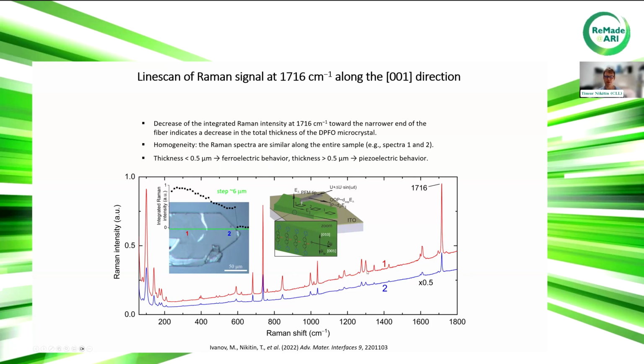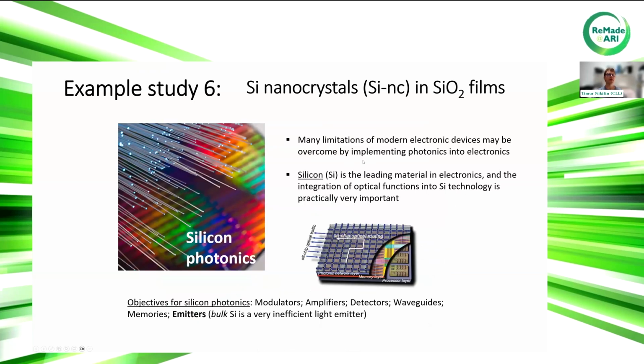There is no shift in the band. They are all at the same positions. It is just the intensity that is dropping. And then it was also observed by the SPM method that the thickness is important, because the piezoelectric behavior completely changes. For thinner samples there was a ferroelectric behavior, and for thicker samples there was a piezoelectric one. So that was important to corroborate with the SPM measurements.